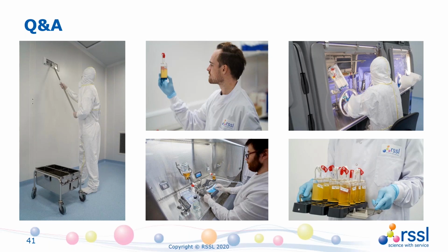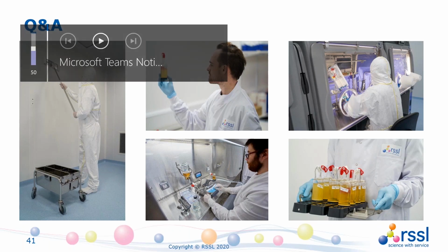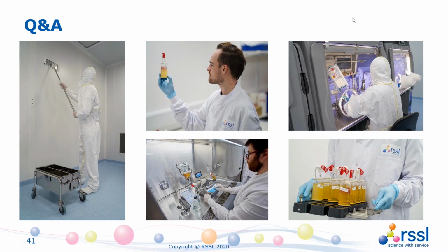clarification. I think my own view is that you can look at this either way, and it depends upon what you're finding, the number of spores and the overall contamination in your program. So you can rotate between the 2, sporicide and non-sporicide, or you can select 2 different non-sporicides and periodically go in with the sporicide at regular intervals. Obviously the second is probably preferable in terms of the health and safety issues and the aggressive nature of sporicides, but there's nothing wrong with the first one if that gives you the level of contamination control that you are seeking to achieve.